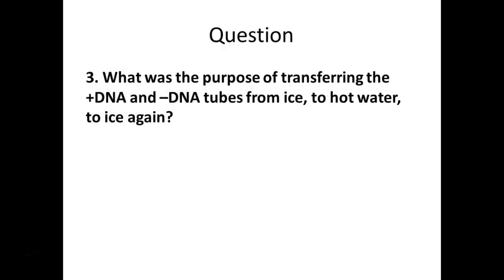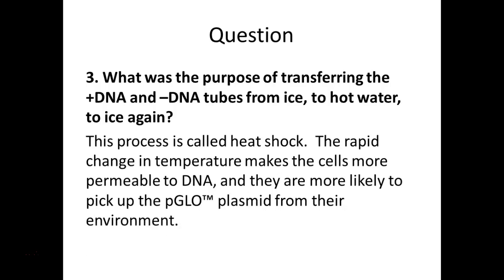So why are we doing this with our tubes? Why are we going ice to hot water to ice again? It has to do with stress, actually. It's what we refer to as heat shock, this process. It's a stressor, and it's going to help get the DNA into the cells.